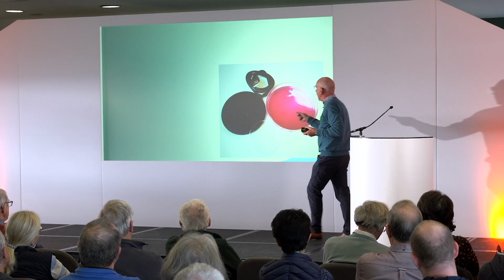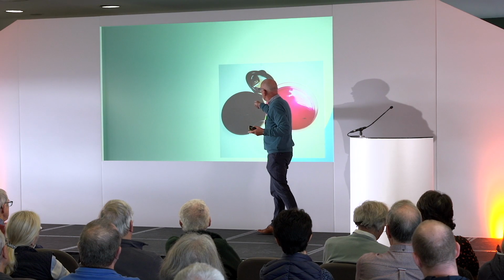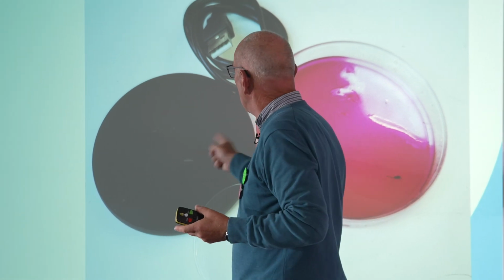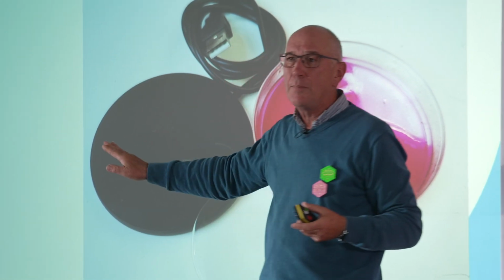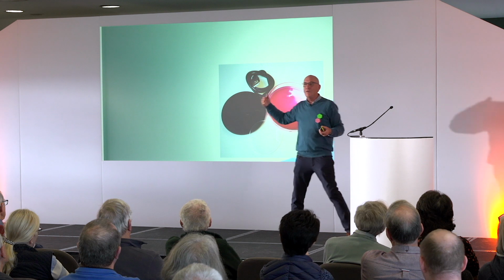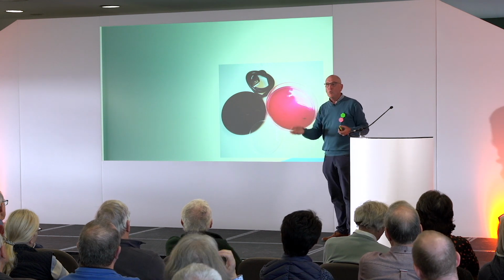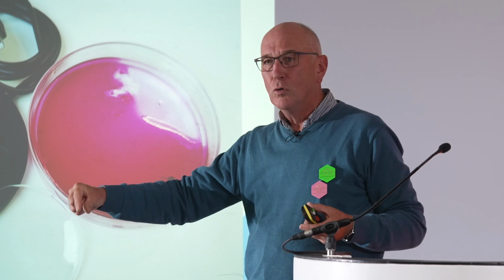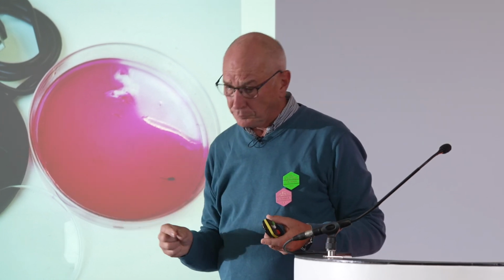And you just put a clean slide on top of here, dry off any liquid you've got on the pollen sample, put the stain on, put the cover slip on, and the USB coffee warmer will do the rest. It goes into a nice slide, take it off, let it cool, and go look under the microscope.